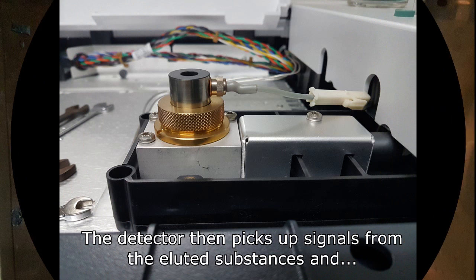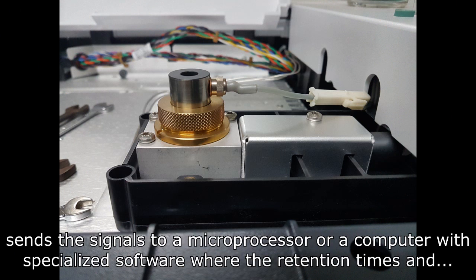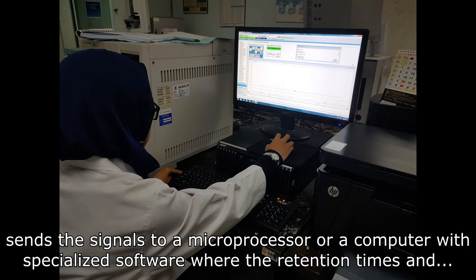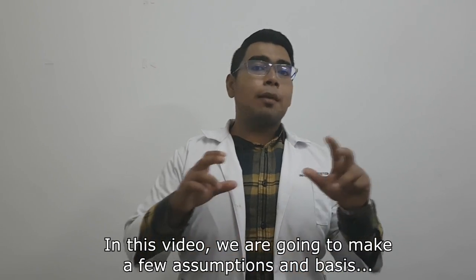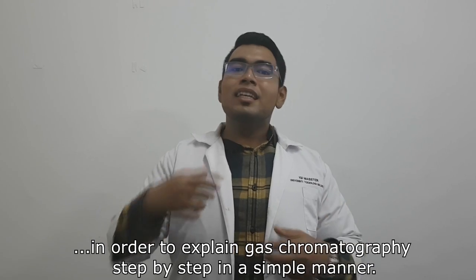The detector then picks up signals from the eluted substances and sends the signals to a microprocessor or a computer with specialized software, where the retention times and signal peaks of each substance are plotted in a chromatogram. In this video, we are going to make a few assumptions and bases in order to explain gas chromatography step by step in a simple manner.